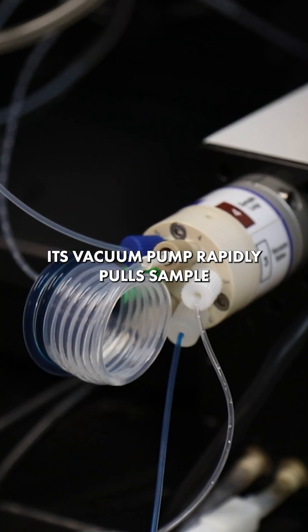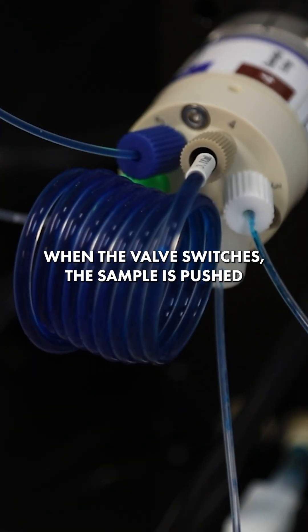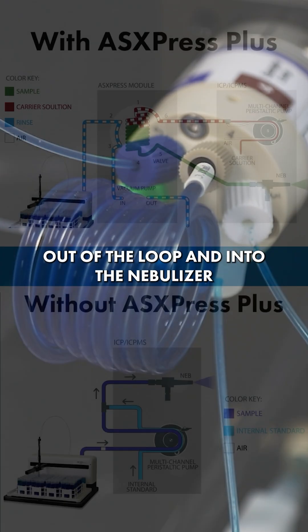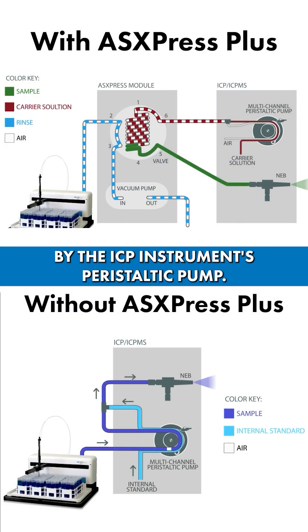Its vacuum pump rapidly pulls sample and positions it on a six-port switching valve near the instrument's nebulizer. When the valve switches, the sample is pushed out of the loop and into the nebulizer by a carrier solution driven by the ICP instrument's peristaltic pump.